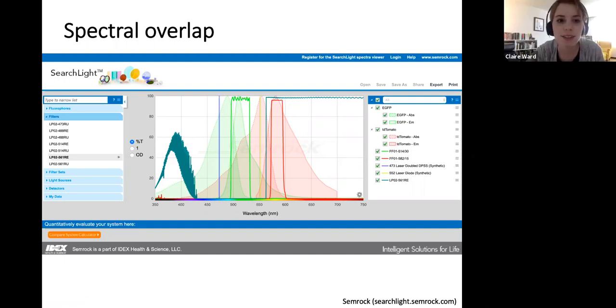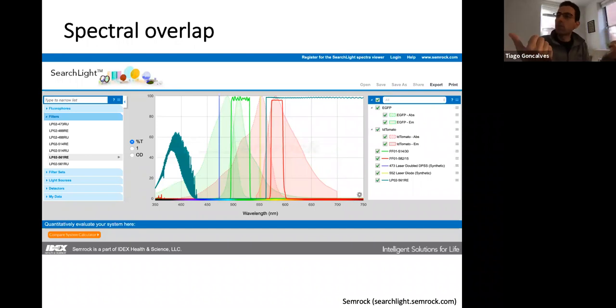Yeah, slash 30 is on either end of whatever value that is. So it's actually 514 is the center, and 30 is the width. So it's 15 nanometers to each side of 514. So that's why the transmission goes up just a little bit before 500, and then it goes down again at 530. Sorry, 530. Yeah, so you get this notch. So this is what this means. 514/30 means it's a notch that is centered around 514, and you have 15 nanometers on each side where you have transmission.